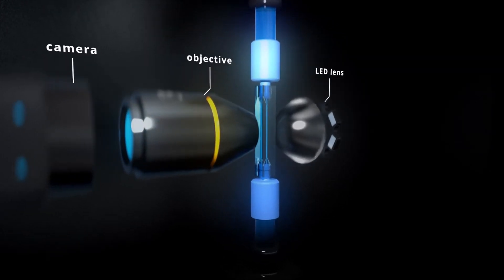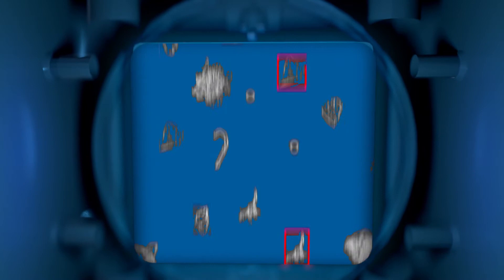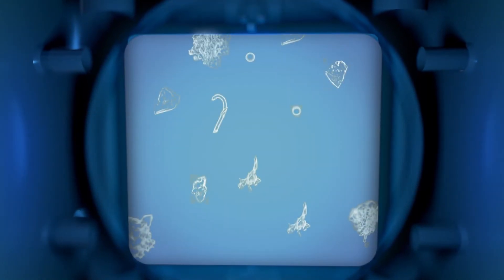Using a stroboscopic flash to eliminate motion blur, a camera captures images of the particles in the sample through an objective lens.